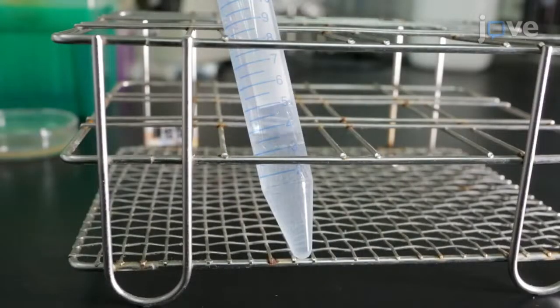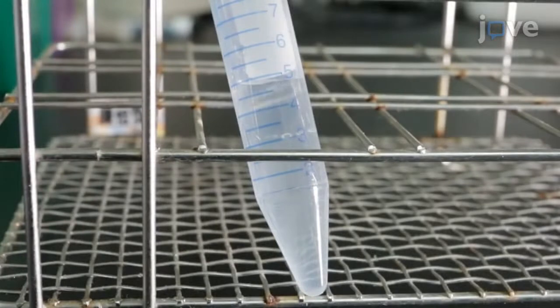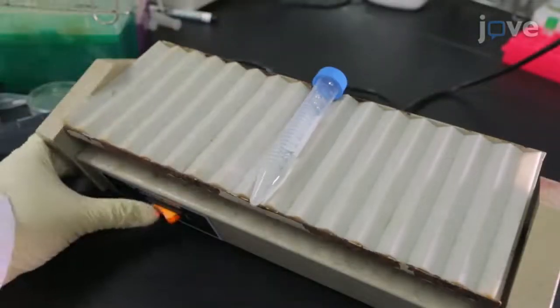Add 1 mL of sodium hypochlorite and 0.5 mL of potassium hydroxide to the tube. Then shake the tube for 6 minutes to lyse the worm bodies.